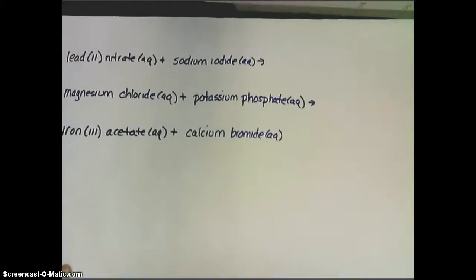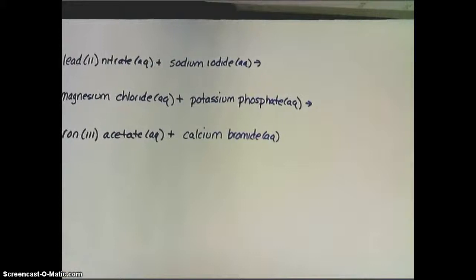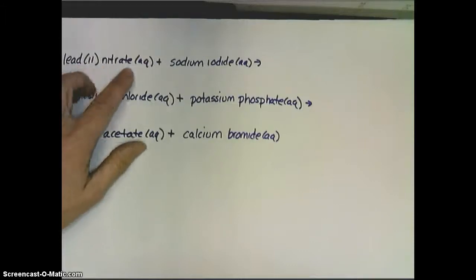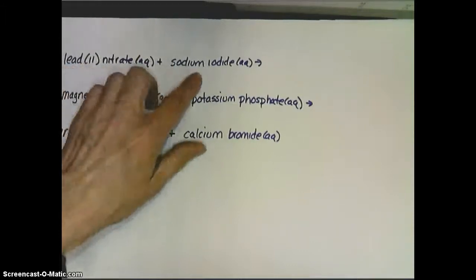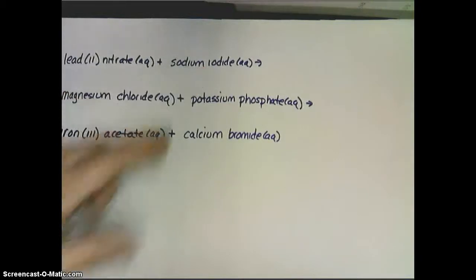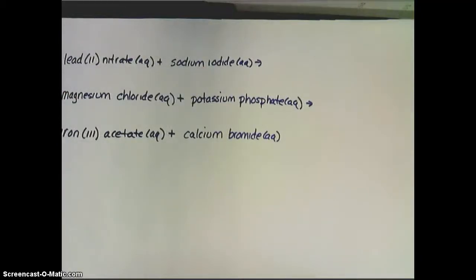Here we have three reactions that we're going to look at today, and the first one we did in class if you were here for the demo. We're going to use that as another example today. I have lead-2 nitrate, aqueous, so it's dissolved in water, and sodium iodide, aqueous, and that's dissolved in water also. When we mix them together, we can have them switch partners.